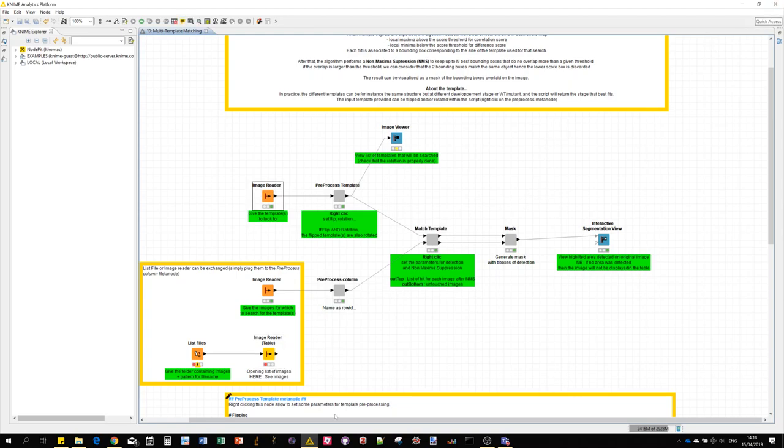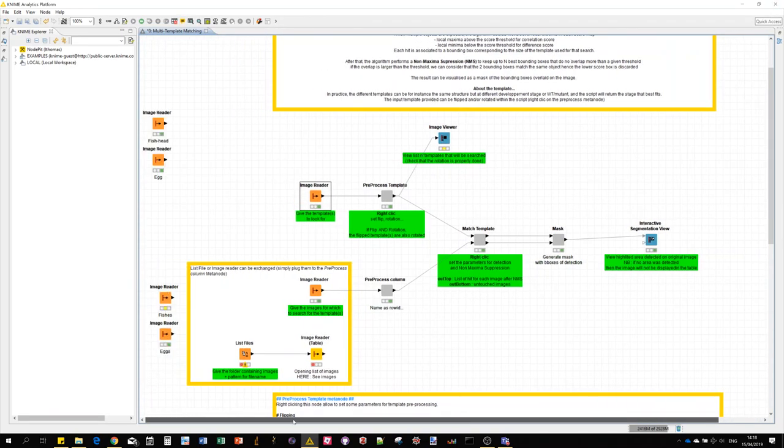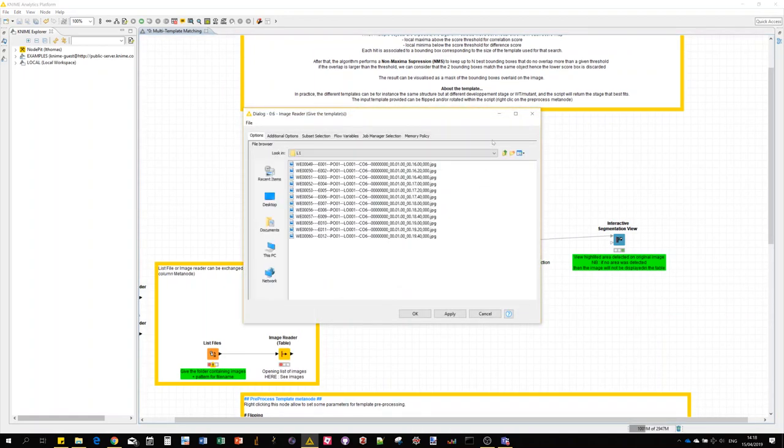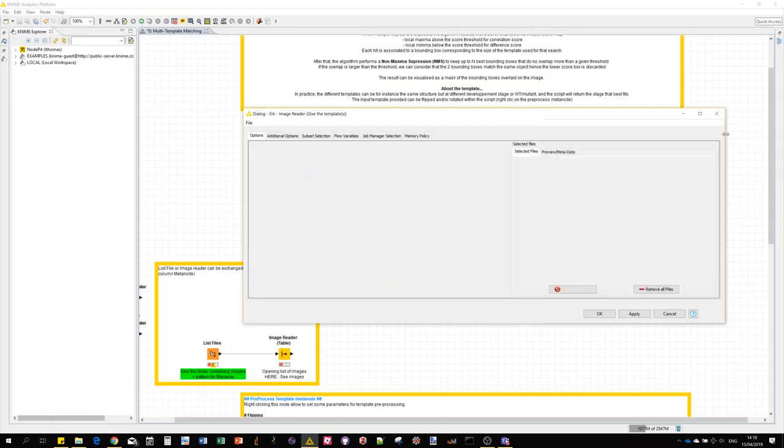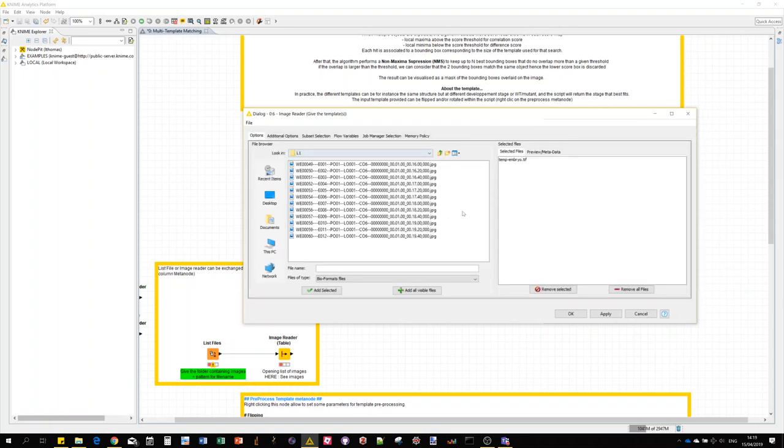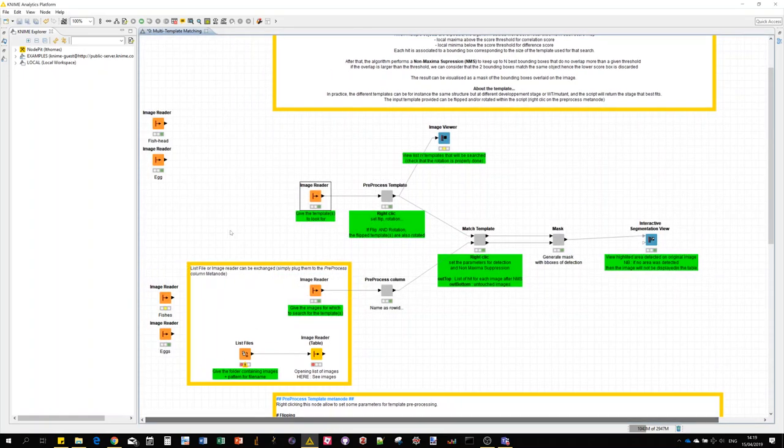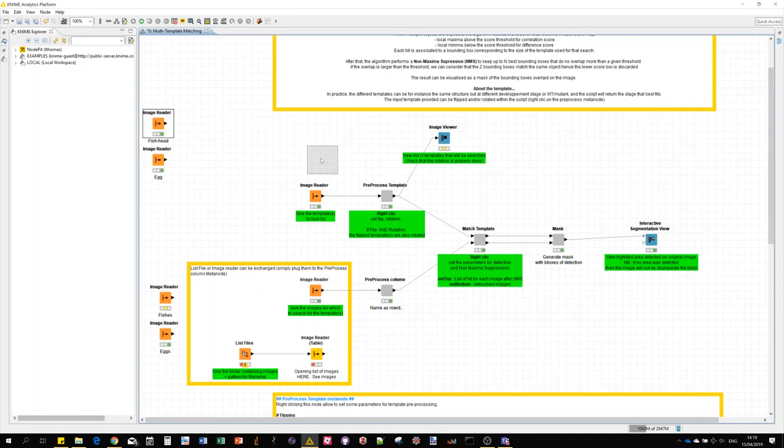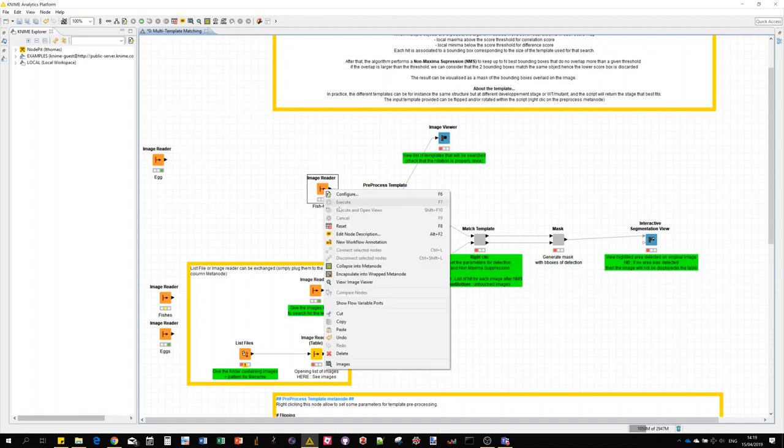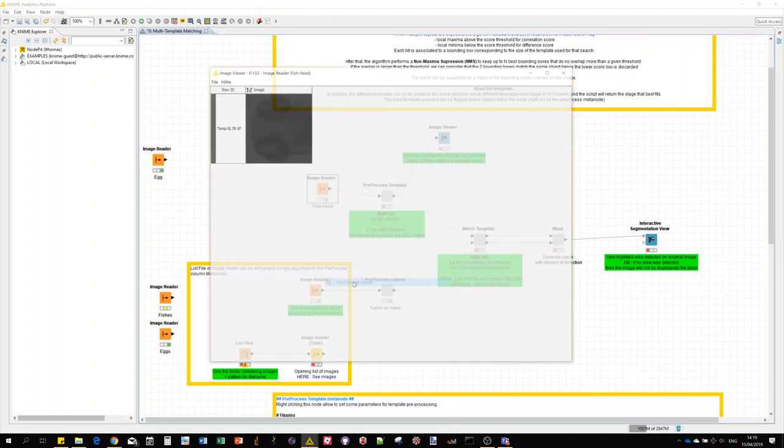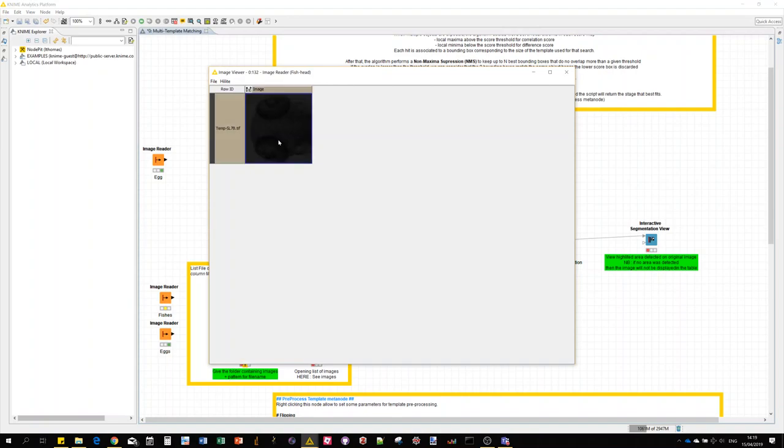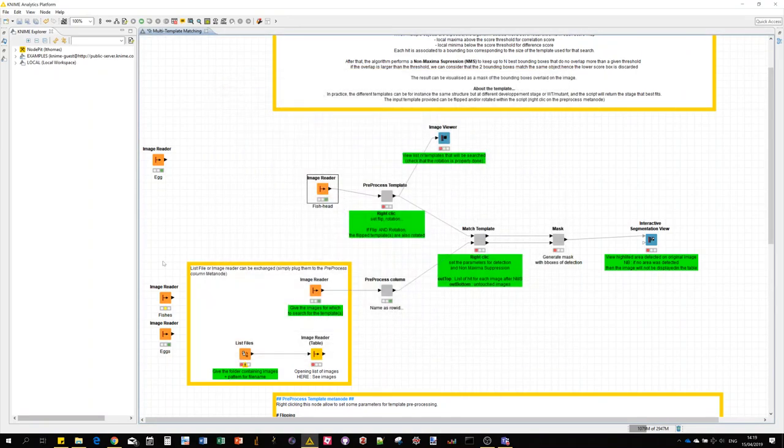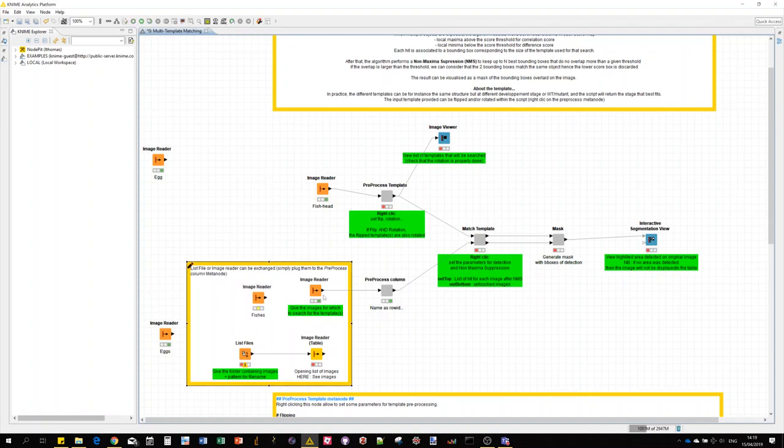Let me show you now another example with different images. I could browse again, change here to the embryo templates. Of course you can also provide a list of templates instead of a unique one, but because the whole thing is kind of modular, I already prepared my template for the next search. This time we are going to do head detection in zebrafish larvae.